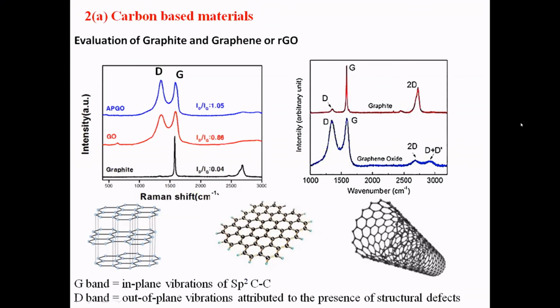So you can easily predict it from the well-known D and G bands. As you see, the shift values are on the x-axis and the intensity is there. For graphite, as it is bundled, there are no defects or a smaller number of defects here. So the G denotes the graphitic nature. It's highly graphitic, which means a lot of layers of hexagonal carbon within the structure.